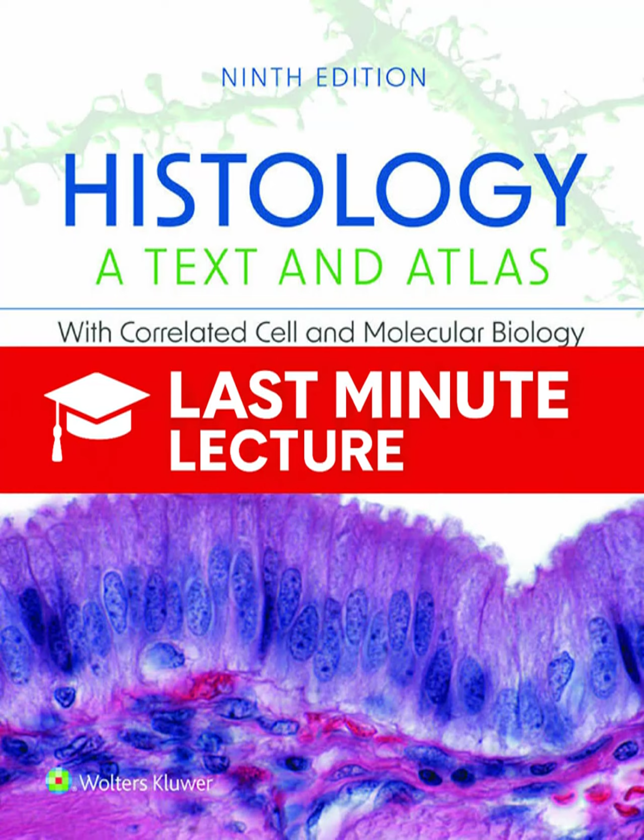This effectively shrinks the size of the fluorescent spot far below the diffraction limit, getting you down to 30 to 80 nanometer resolution. And what about the single molecule methods like PALM and STORM? PALM and STORM rely on photoactivatable fluorescent molecules. The key insight is, if you only activate a tiny statistically resolvable handful of molecules at any one time, you can locate the center of each one with extreme precision. You cycle this process, activate, locate, deactivate thousands of times, and a computer compiles all that data to build an image with resolutions approaching 10 to 20 nanometers.